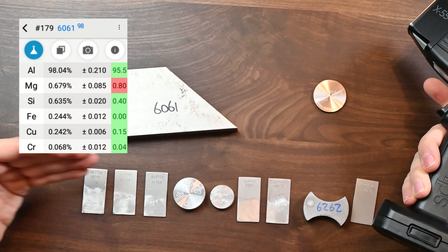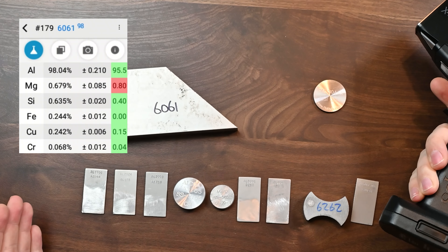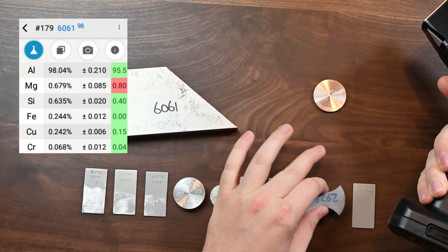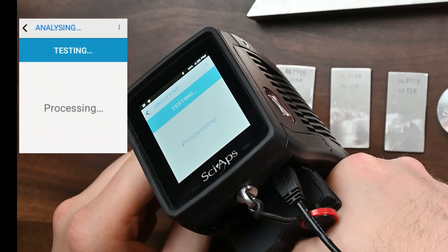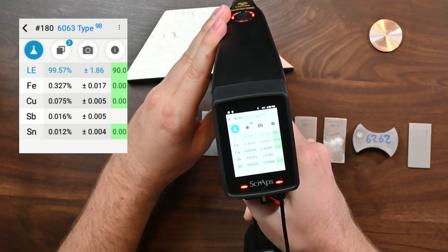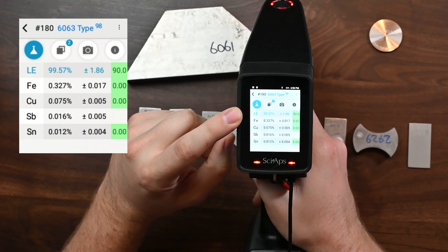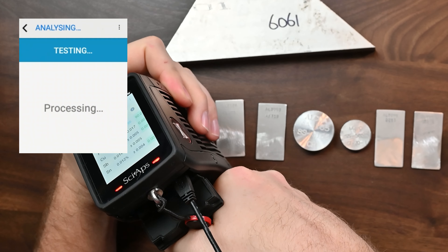To demonstrate the rest of what's going on today, just because I don't have scrap pieces of all the alloys, I do have reference materials and some materials I've received from industry. I like to call this one my Batman sample, but we'll get there soon. Let's first start with 1100. When we test this alloy and shoot it for just a second, the analyzer says it's 6063 — but we know it's 1100 aluminum. That's because we're not looking for light elements yet, and the analyzer is just a little confused.